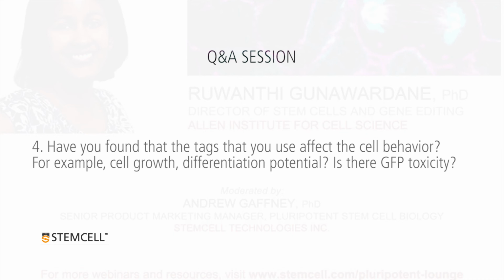We're looking at length of time at different parts of mitosis. We do growth rate, so we do a 48 and a 72-hour cell growth rate with the ATP readout. And in this clonal line generation process, we do a lot of culturing, so we always keep an eye on whether some clones grow faster or slower. That does indeed happen when we are at like the 24 clonal stage. And then the clones that slow down or speed up also have other issues with them. They start to spontaneously differentiate sometimes. So those end up getting dropped, but we don't know for what reason, because they just don't meet several of our criteria.